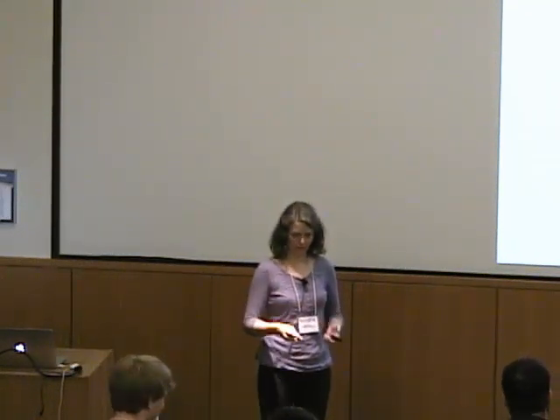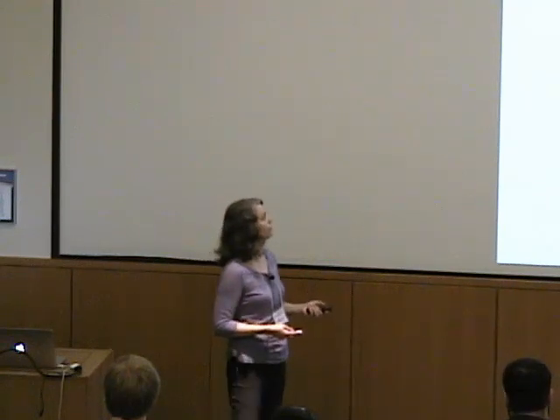But it is true that it can be challenging sometimes to get high-quality, high-resolution NMR spectra when your sample's paramagnetic. But even in that case, there is a lot of information in the spectra, even when you have difficult conditions and broad lines like you can get. So I'm going to show you a number of examples of how you can get information on electronic structure of your compound by analyzing some of these properties of your spectrum.